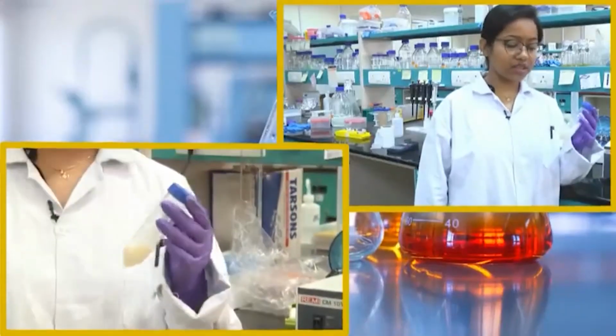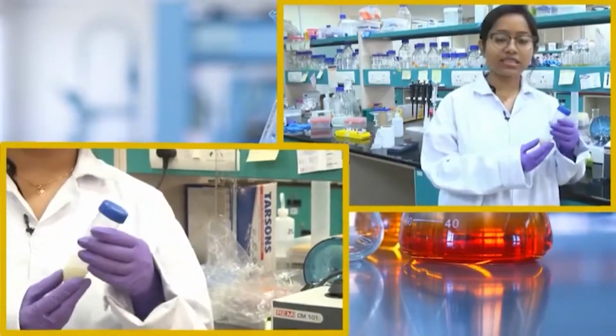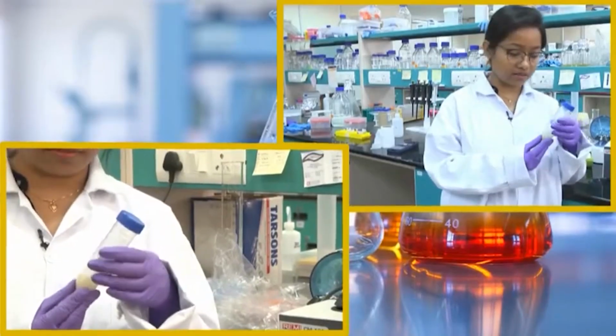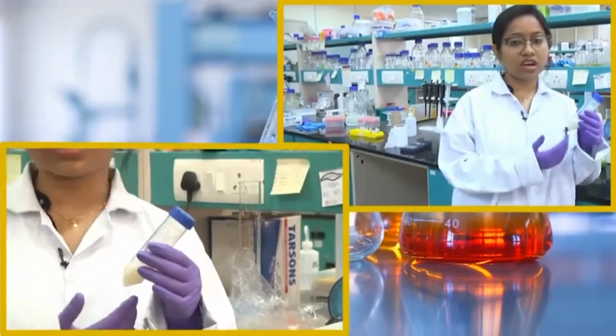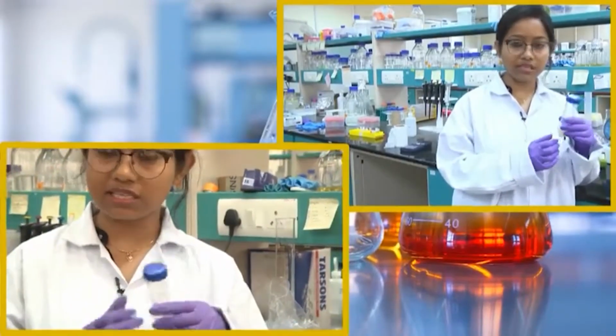So, I have used a vortex machine to properly dissolve the cell pellet, whatever the pellet or the cells are there inside the solution, to mix it up properly. Also the PMSF or other ingredients that I am putting inside the solution, so that it is thoroughly mixed.